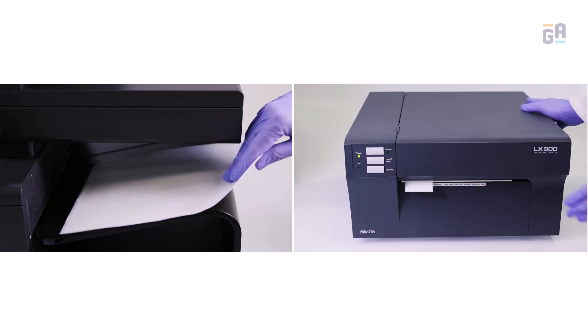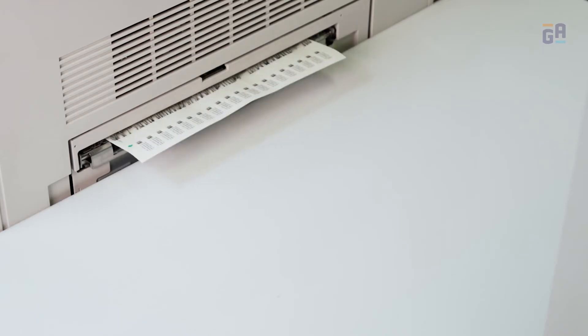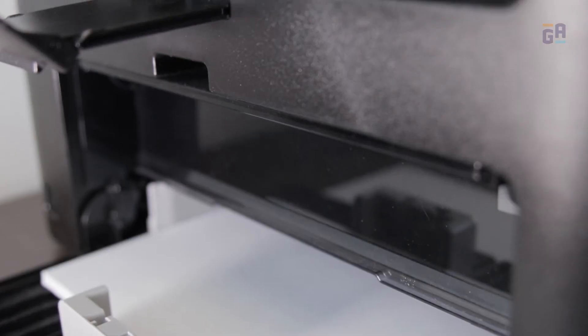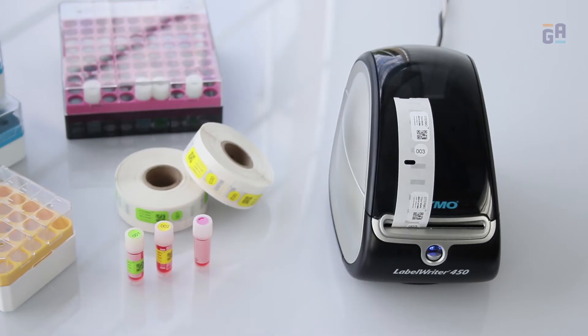Both sheet and roll formats are available to fit any printer, such as direct thermal, laser, inkjet, thermal transfer and dymo printers.